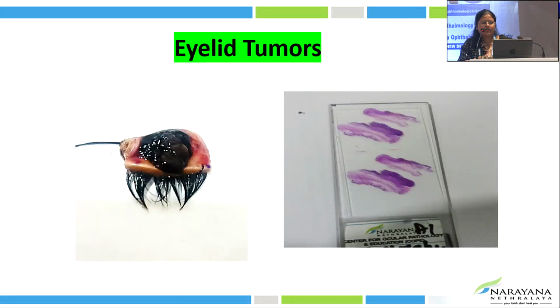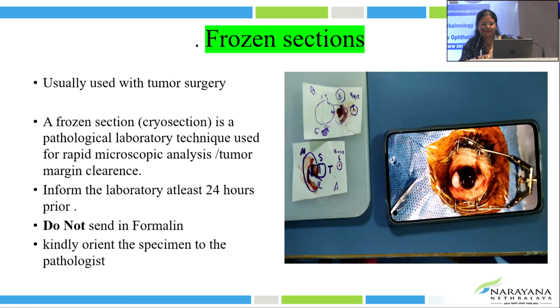Eyelid tumors, again, ma'am has already touched upon. So this is how the tumors come to us, and we separate out the margins, we bread loaf it, and then we have to comment on the depth of involvement of the tarsal plate.